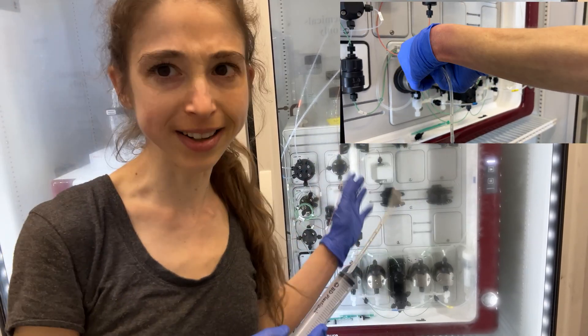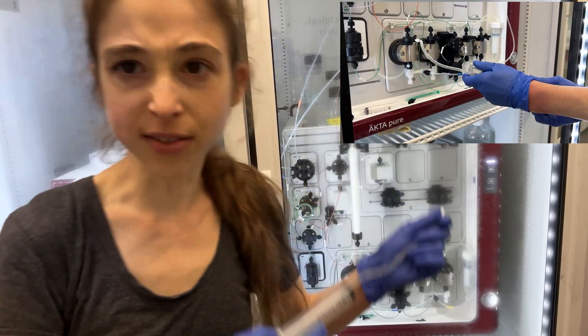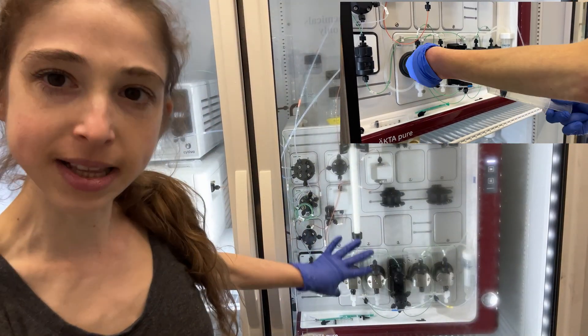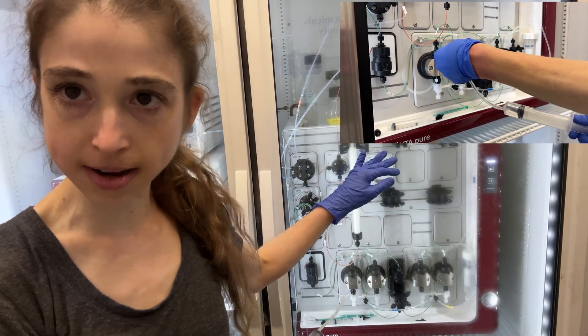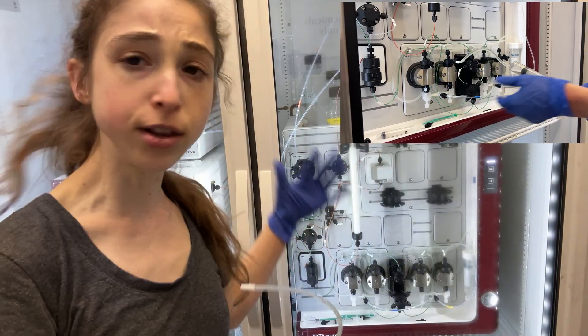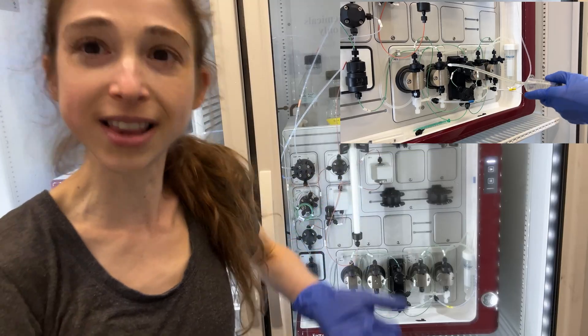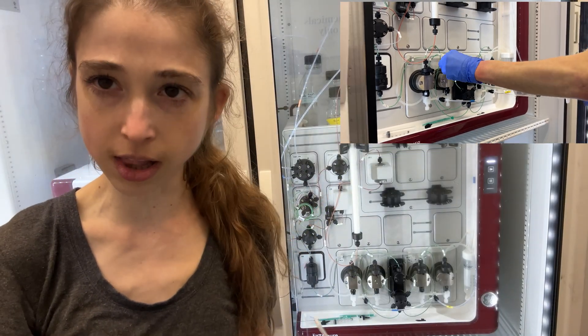When we refer to priming a pump on an ACTA, what we're doing is basically sucking a little bit of liquid out from these pumps that control the flow through the system, and we do that in order to remove any air that is in those pumps that we don't want getting onto our column or preventing the liquid from getting onto our column.